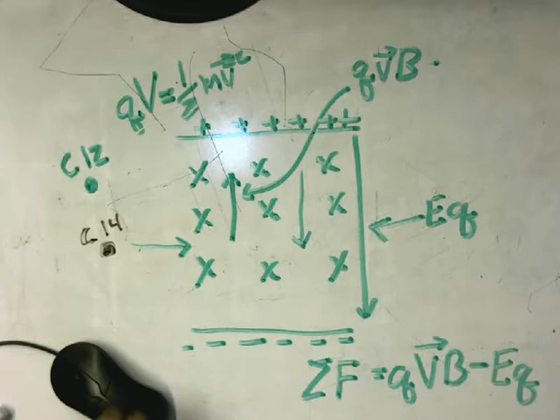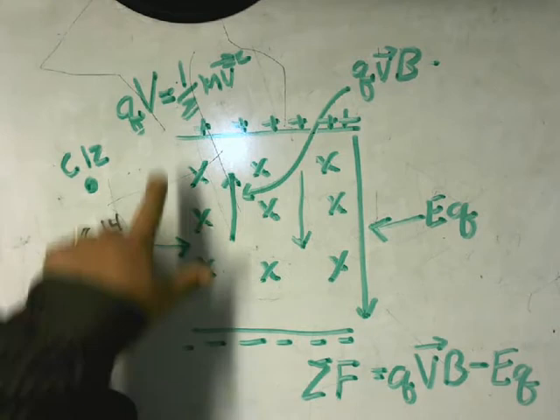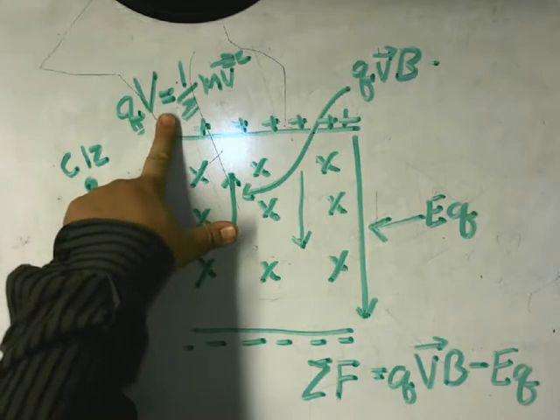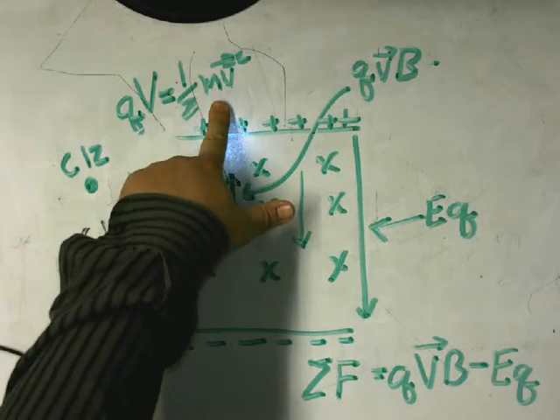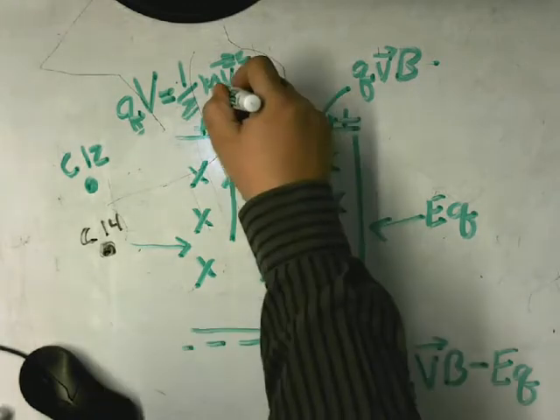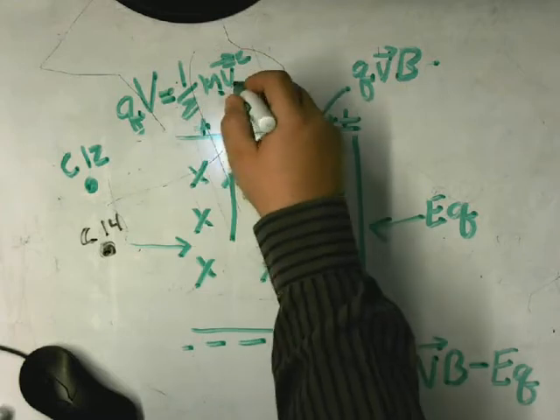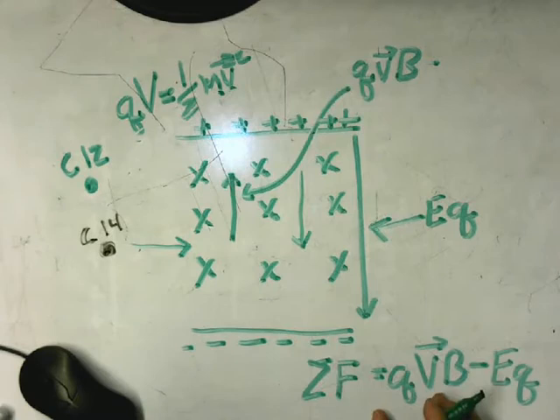But if you look at it, if you look at QV over here, QV, that's voltage, is equal to 1/2 mv squared. QV, velocity, B, is equal to the amount of force that it experiences. So if I can solve this for Q times velocity, I can substitute it into here, and I have a way in which I can control which particles get through and which particles don't.